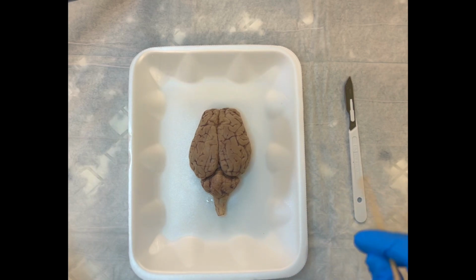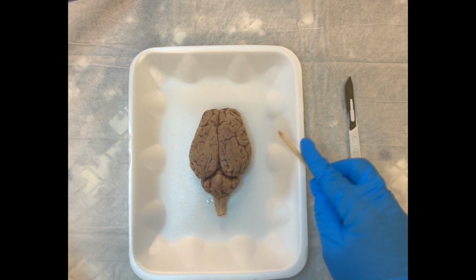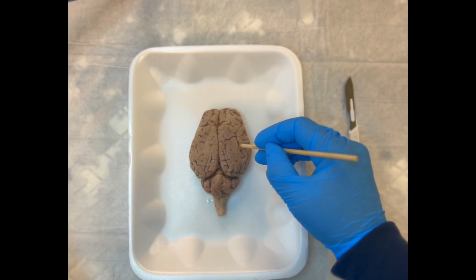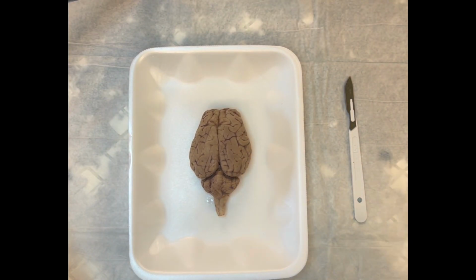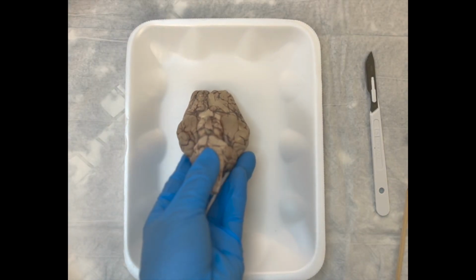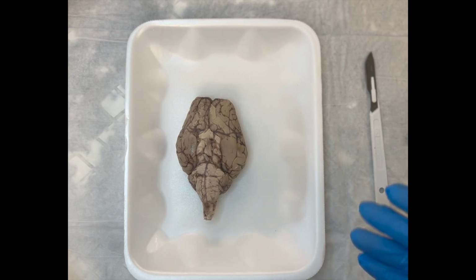One other thing that we can identify here are the sulci and the gyri. So each ridge being a gyrus, then these shallow little grooves here being a sulcus, collectively called sulci, or plural would be gyri. Then if we flip the brain over, to an inferior view here, we can see a lot of other structures. Some parts are not really left intact. It's really going to depend on your sheep brain, so you may see some variability here from what I'm showing you in this video, and that's perfectly fine.